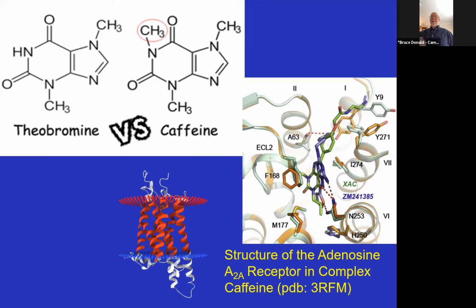So in addition to saying what happens with the inhibitor itself, we can say things like, well, what's the structure of the receptor that binds the caffeine and theobromine molecules, right? If you look at the differences here. So this is a very nice study of this receptor. So this is kind of what we're trying to get out of this course. How do we get at these structures, understand them, and design new things? All right, a membrane protein too. So this is a challenging project.